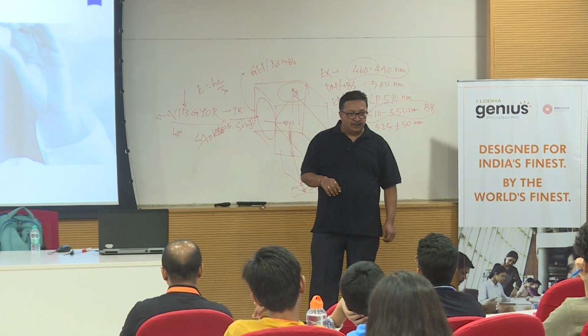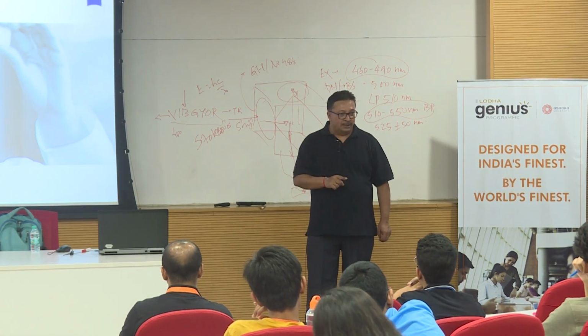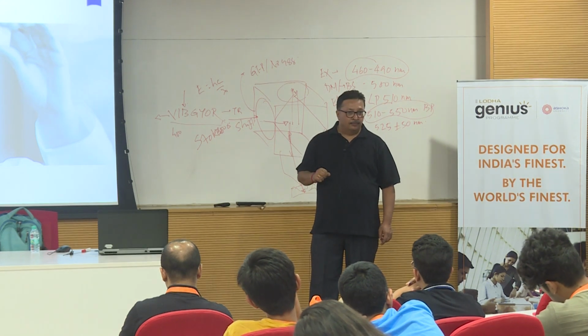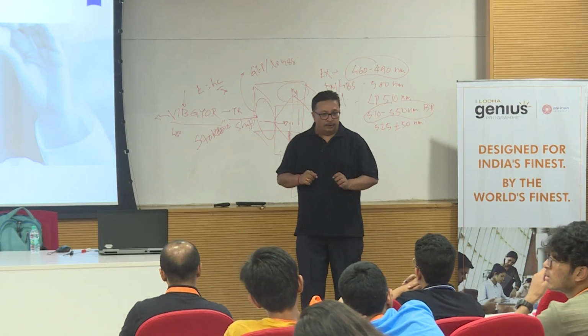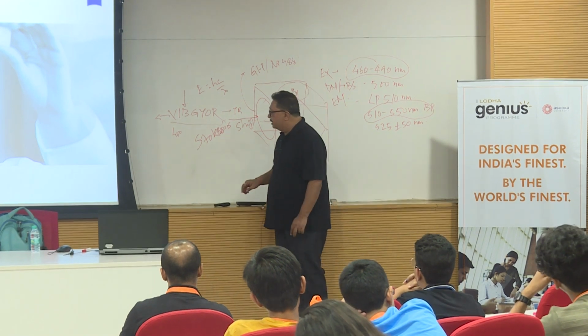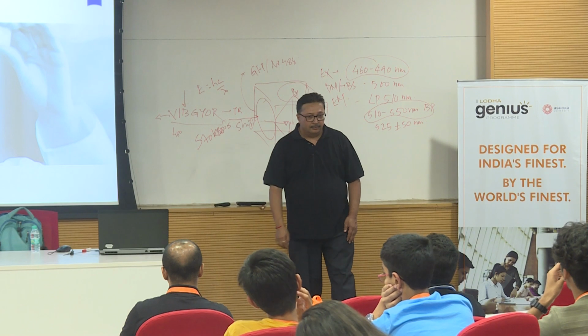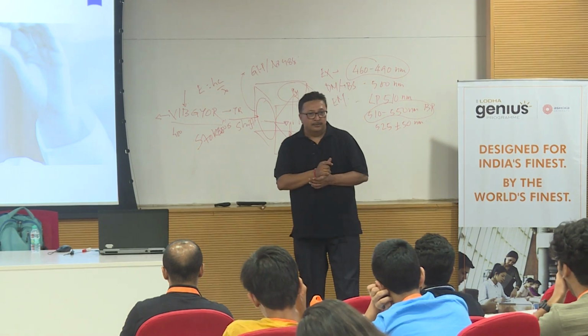When I say coherent, it means one single phase, one single frequency, one single wavelength at which it will excite your sample. So your lasers, so on a confocal, what changes is this white light gets converted to a laser source. What is laser? Any idea?